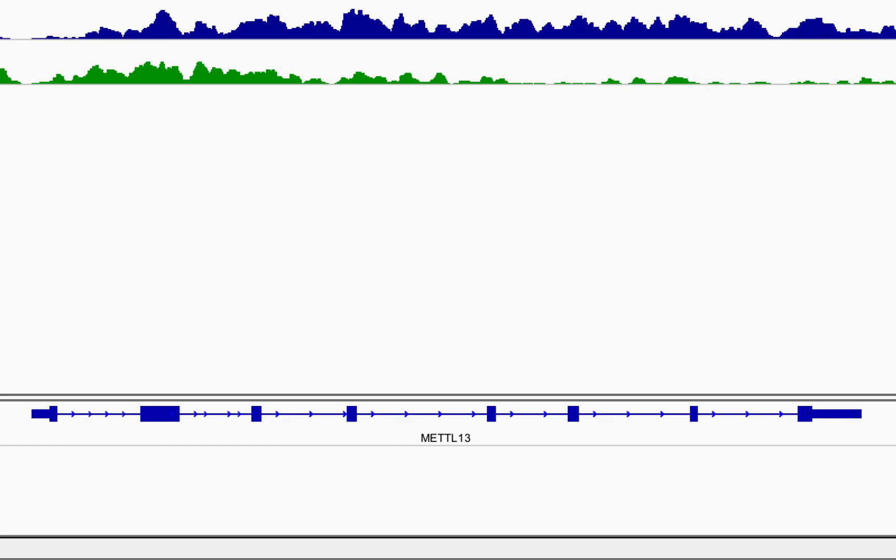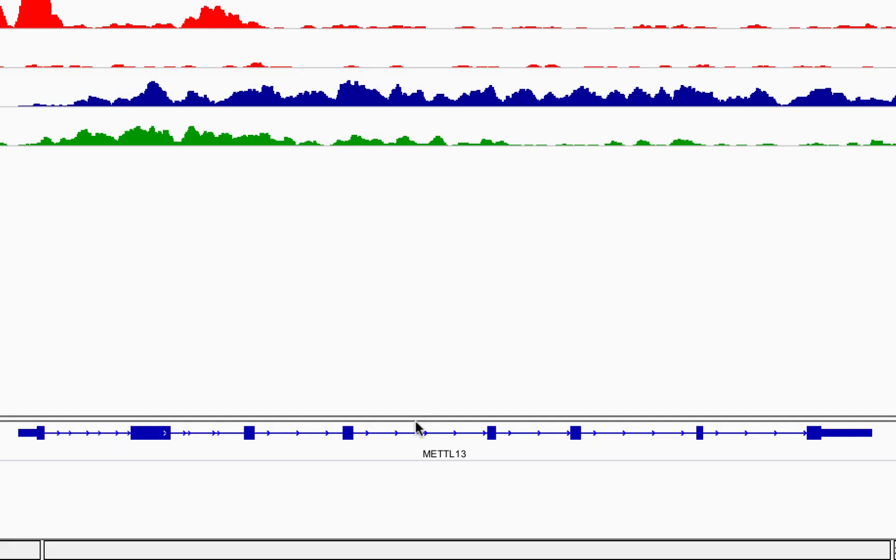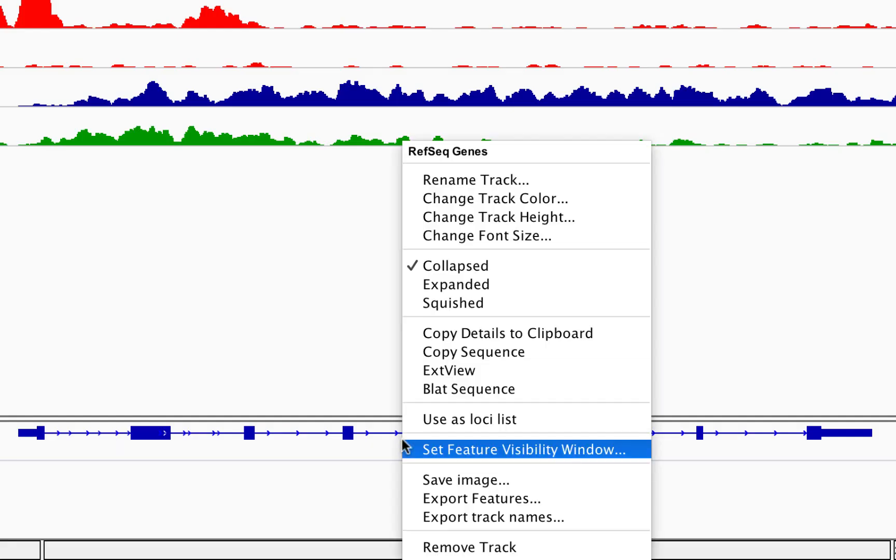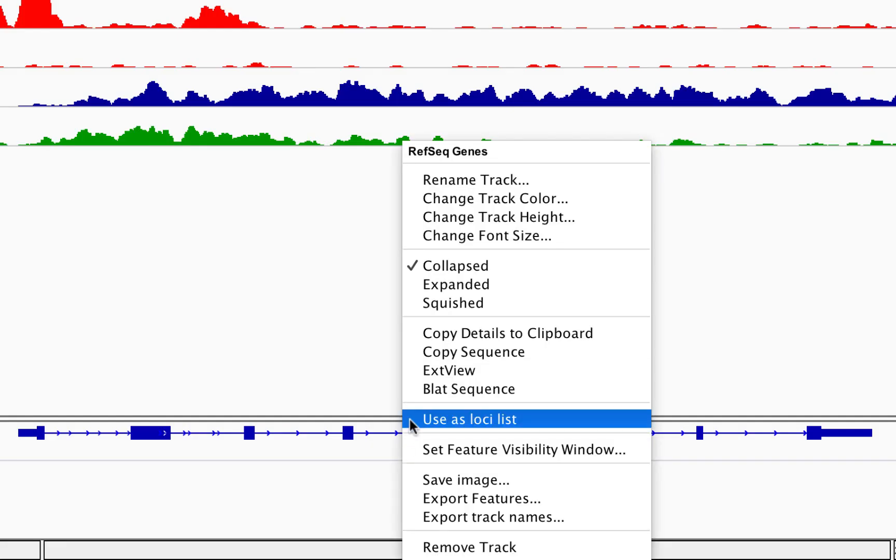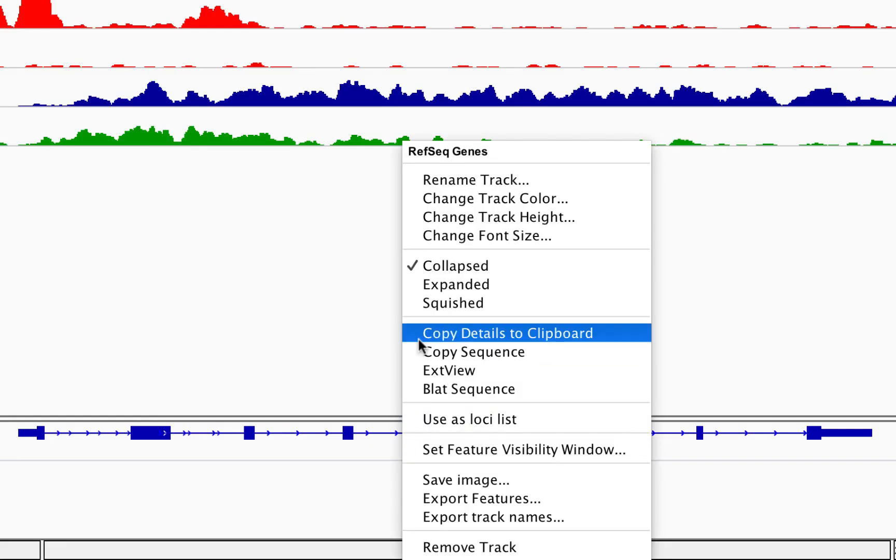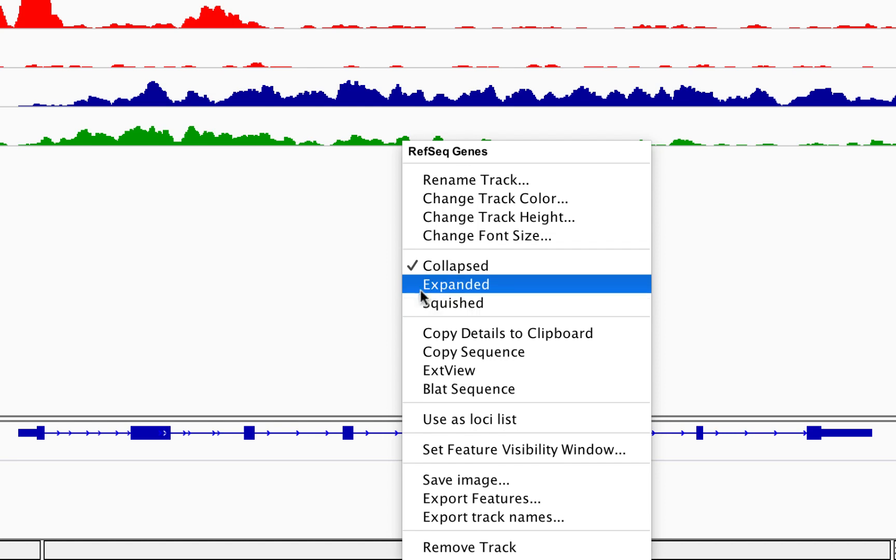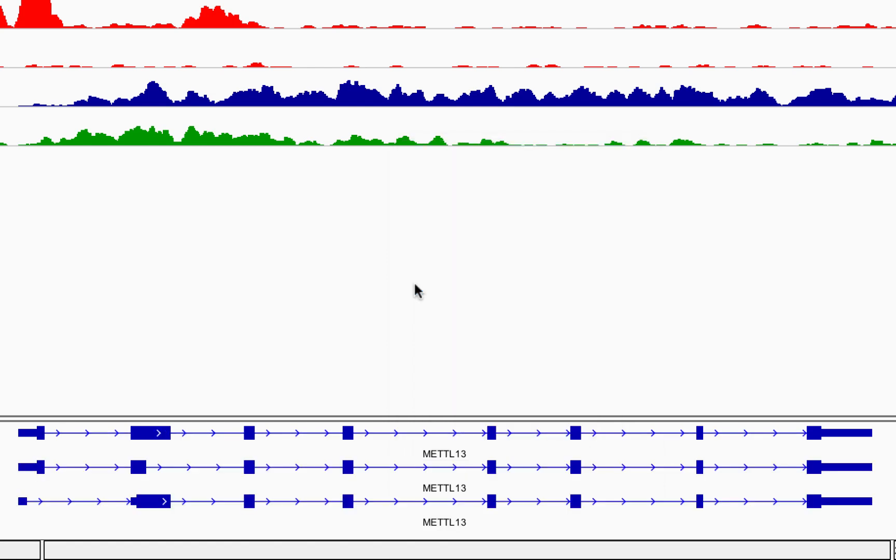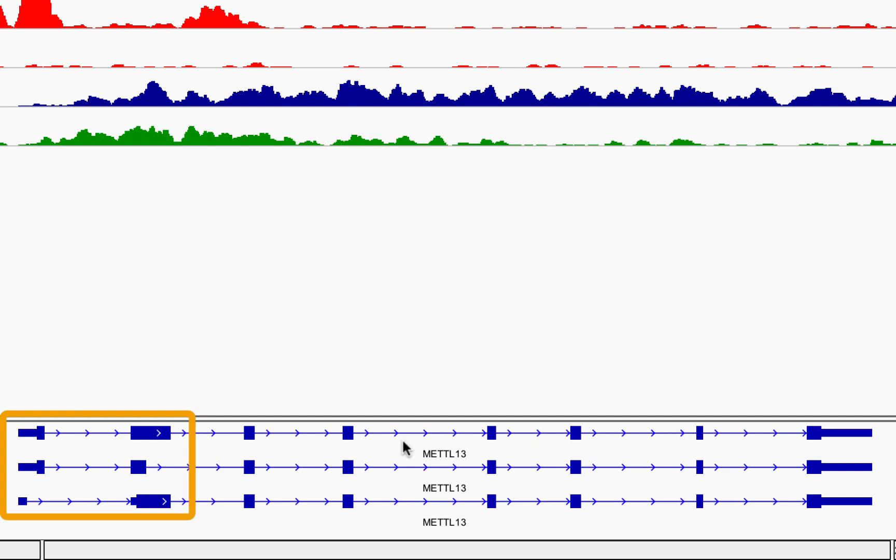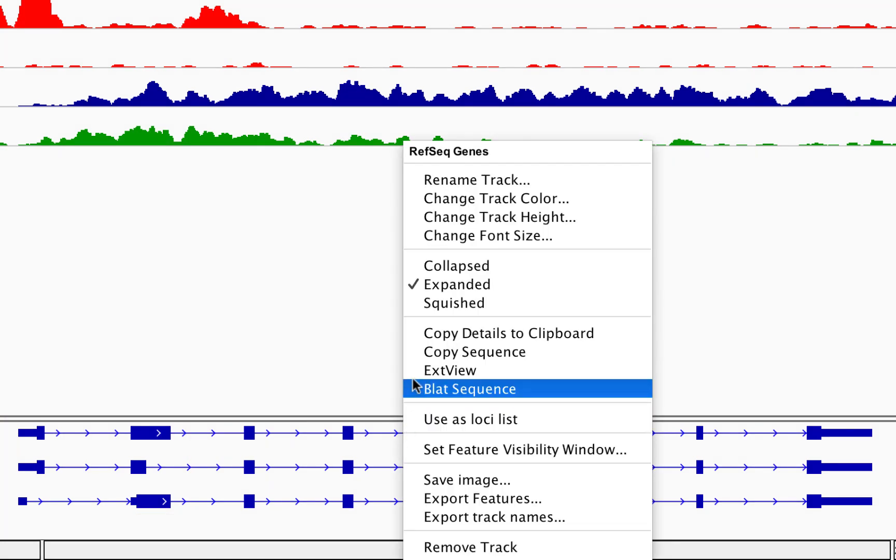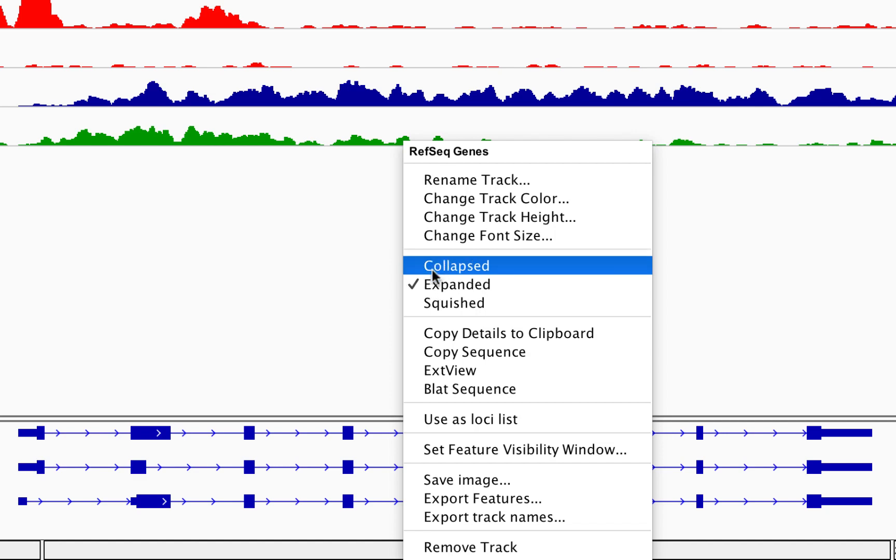If you want to see the splice variants of genes, right-click the sequence track and select Expanded. Here we can see that METTL13 has three variants, where the 5' UTRs and first exons are spliced differently. Let's collapse the splice variants for now.